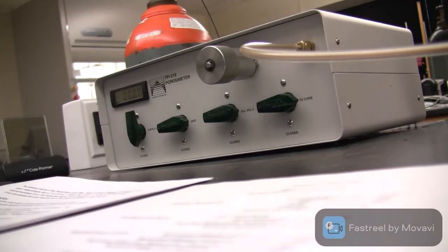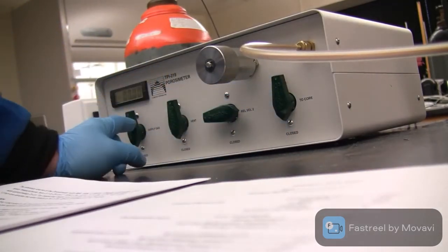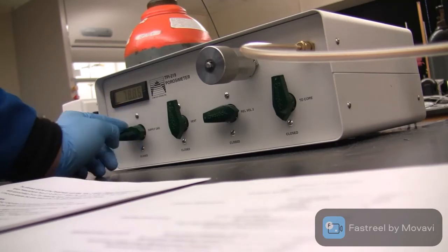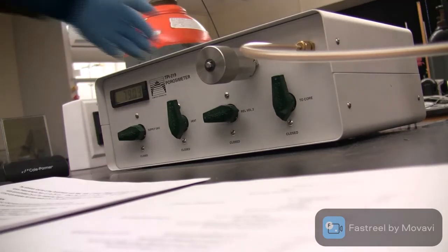So next step is, you remember we had 3 steps in our experiment. Now we start the first one of them. So we close the 3 valves, this one, this one, and this one, and then we open the supply gas valve, and we try to bring the pressure back to 95. If it doesn't, we need to adjust it manually.